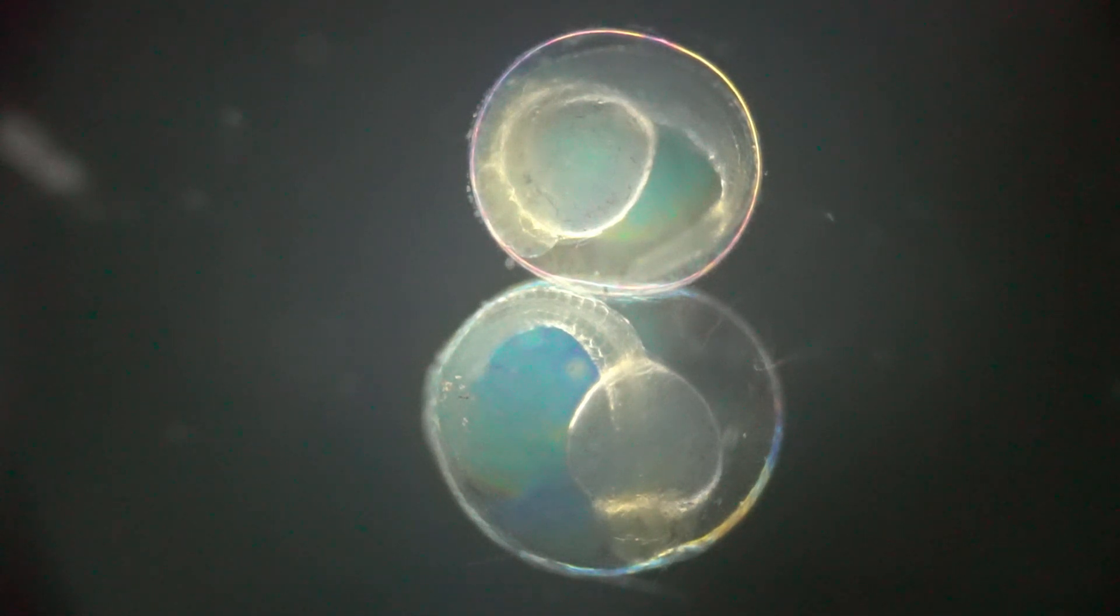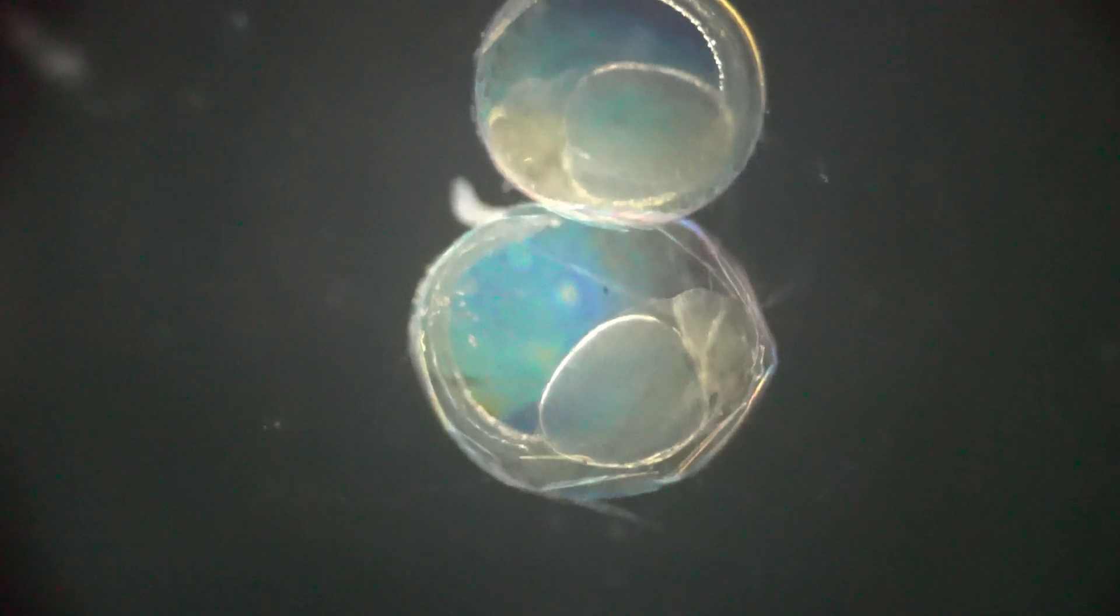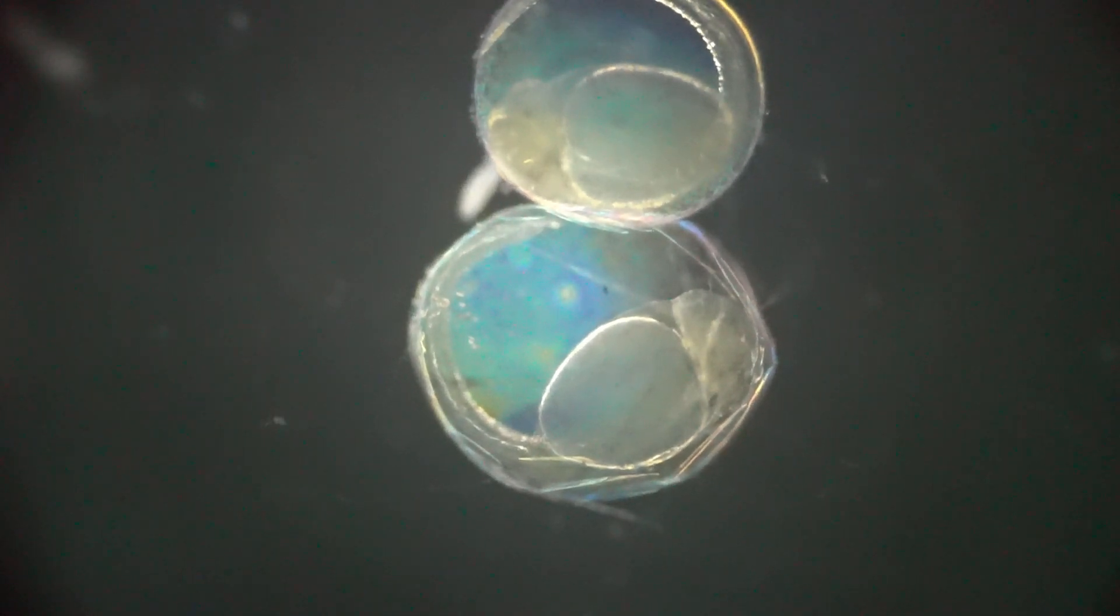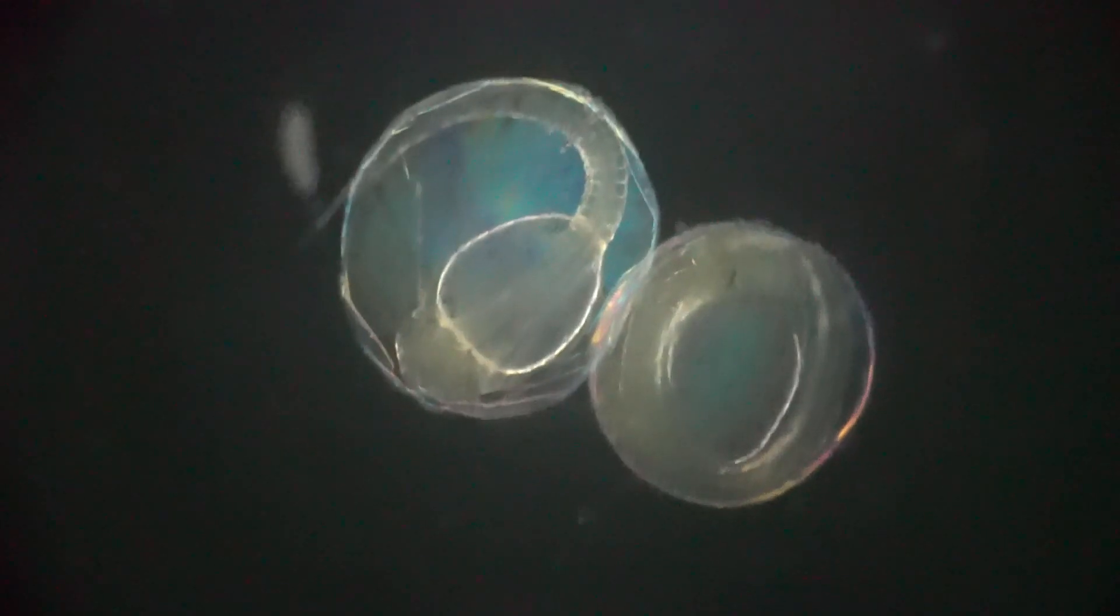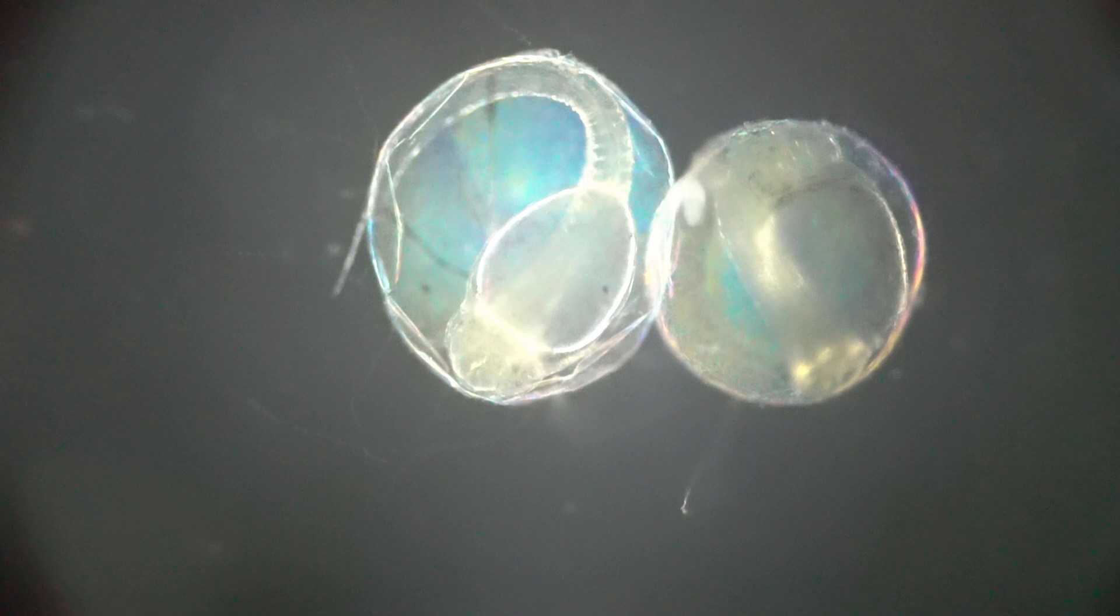There is definitely a large yolk sac visible. Now the other little organisms running around the eggs are paramecium that are in the water column that are just swimming around the outside of the egg really not causing them any harm. Now you notice that the membrane of this egg is starting to get a little bit weaker. It's starting to show some wrinkles in it, wear and tear, and it's a little bit more misshapen.